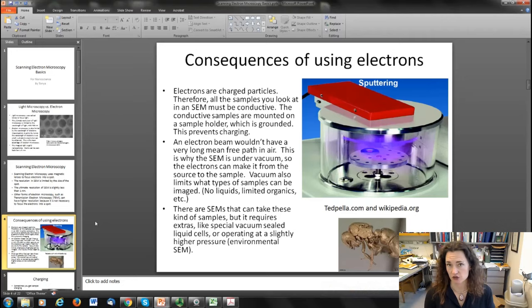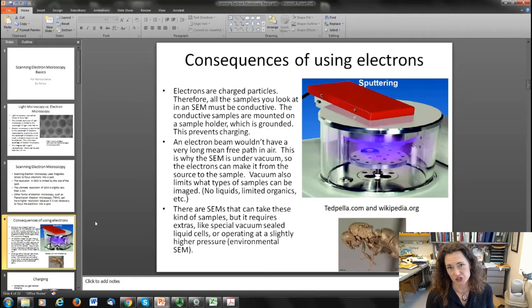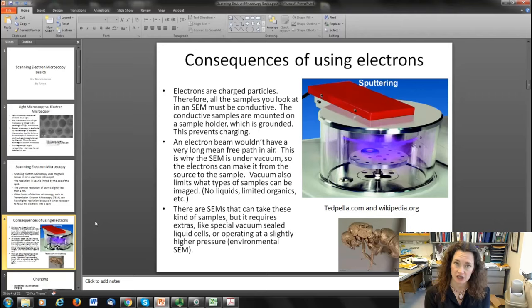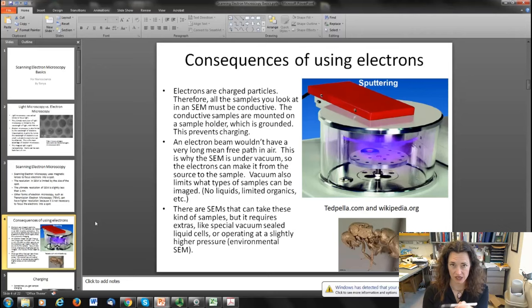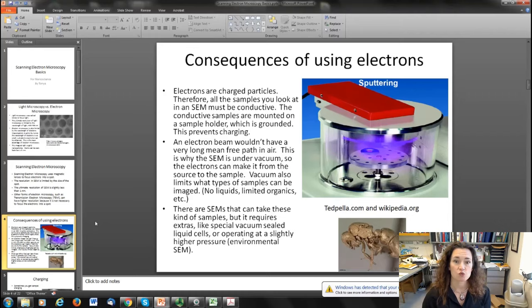For all forms of electron microscopy there are consequences of using electrons as your imaging medium. First of all, electrons are charged particles, so samples you look at in an SEM should usually be conductive, otherwise they're going to charge up. If you focused on an insulator, the electrons would strike the sample, some would get embedded, and your sample would end up charged. If the pen is negatively charged and the incoming electrons are negatively charged, they'll repel one another and your beam won't really make it to your sample, causing distortion of the image.